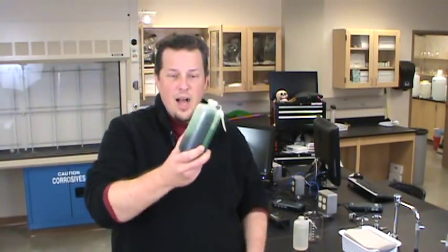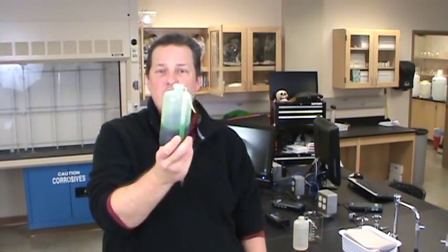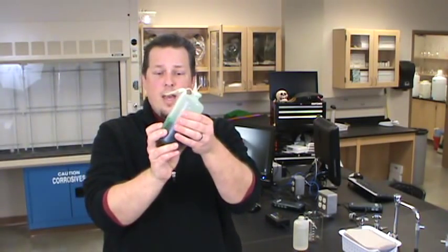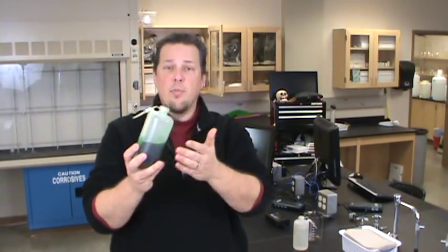Because I can look at this particular solution and say that it's green, but what does that green tell me? What does that tell me about the chemicals that make this substance up? And if this were a chemical reaction, what does that color tell me about how the chemical reaction is proceeding? So what can a spectrophotometer do for us?